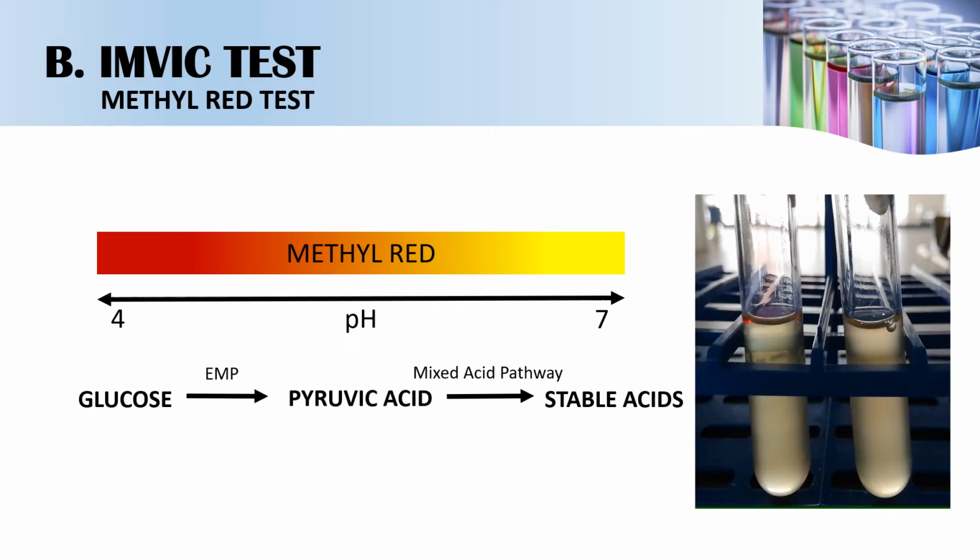So this is an actual demonstration of the MR test. Again, presence of yellow color indicates a negative test, while the presence of red color indicates a positive test.